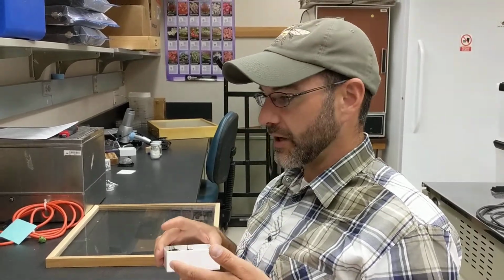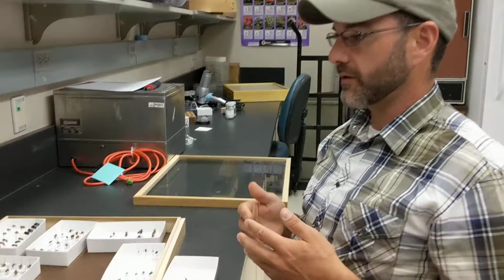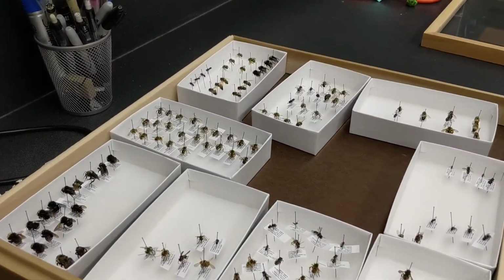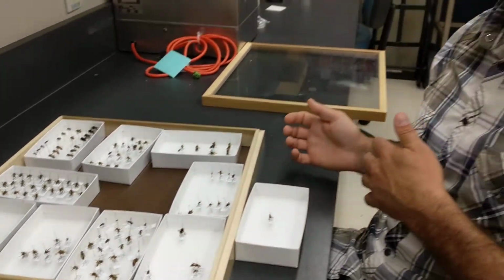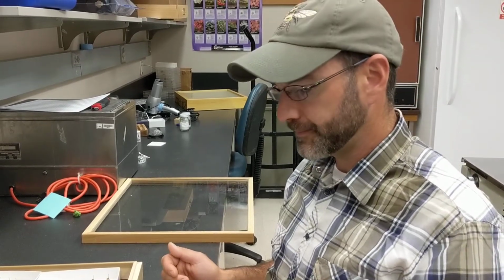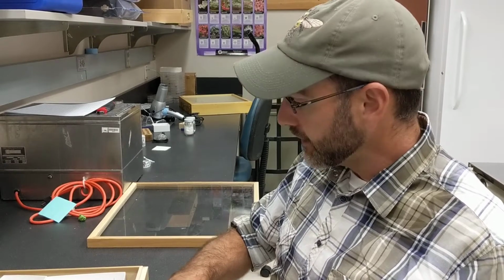So when I do it, I can sort everything by eye to the generic level, and then lots of the species I can pull out and identify them by eye to species level too. But when you're starting, you're probably going to sort them fairly coarsely to bumblebees or things you think are maybe at family level. This is a mining bee, this is a sweat bee, this is a longhorn bee, and so on. So this is something you may not even use a microscope for. This is going to be an eyeball quick sort.